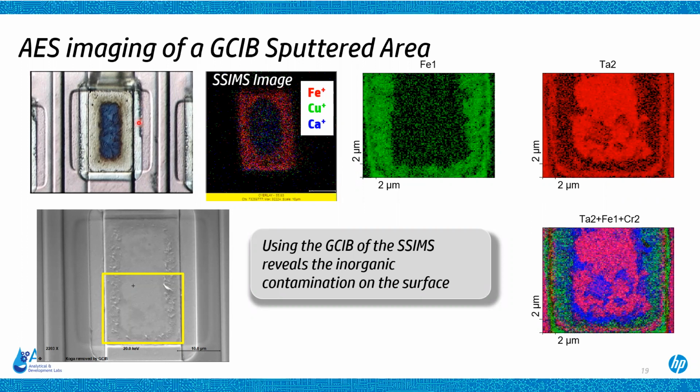This plate is called an anti-cavitation plate. It's made out of tantalum. We map the tantalum for completeness, and we see they actually leave some holes. This is one of the reasons you do image maps, right? So that you can determine, have you filled in everything? Well, if you overlay these maps, you see there's some gaps like here.